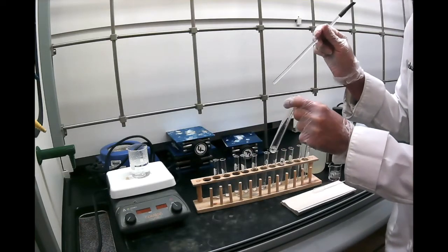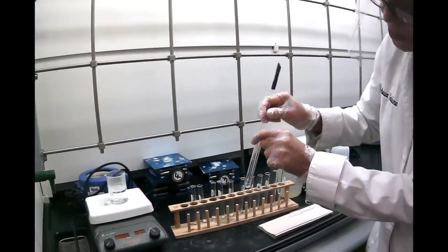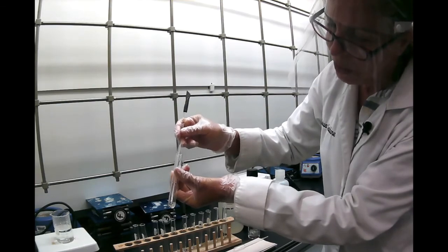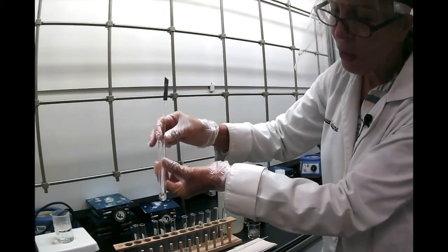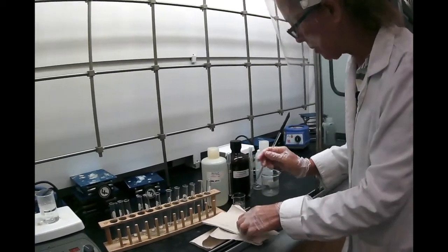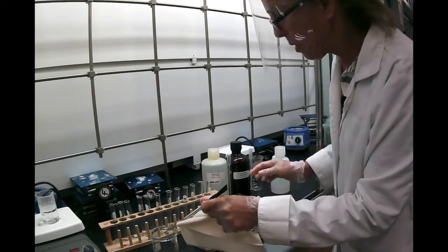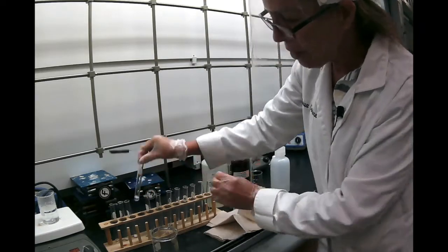Now in this lab, don't put a stopper on to shake. Make sure you use a clean glass rod and stir to see if it dissolves in the water. You see already that resorcinol is completely soluble in cold water, so we don't need to heat it here. Then I'm going to clean up my rod. It's always a good idea to have a beaker for waste. Make sure you clean the rod as best as you can and wipe it dry. Then you're going to look at naphthalene.